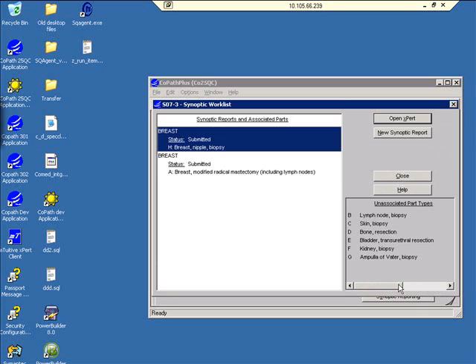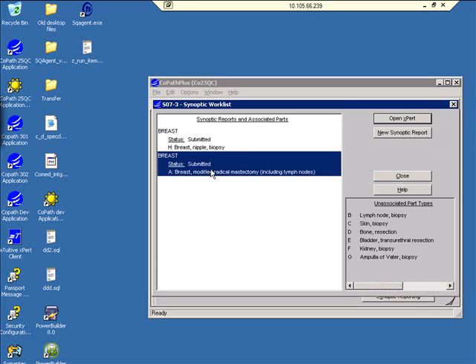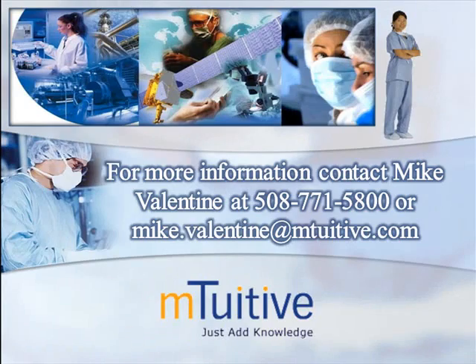Finally, we'll go back into the Synoptic worklist. There's the report we just submitted. We could make changes to it if we wanted to. Thank you for viewing this demonstration of Expert 4 Pathology.